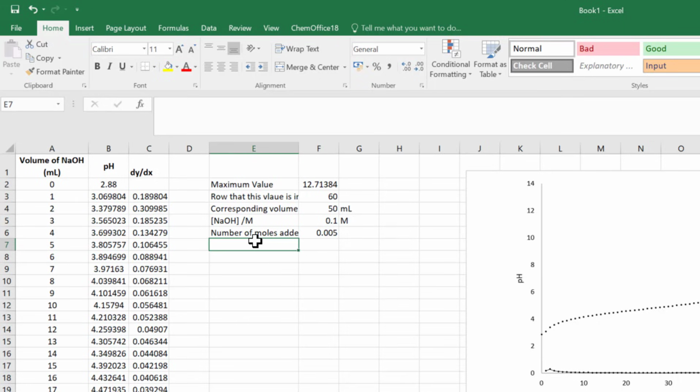The molar ratio, well, let's say that this is a single acid, single base titration, so let's say something like ethanoic acid versus sodium hydroxide. So the molar ratio there will be 1:1. So that means we can easily work out the number of moles in analyte.